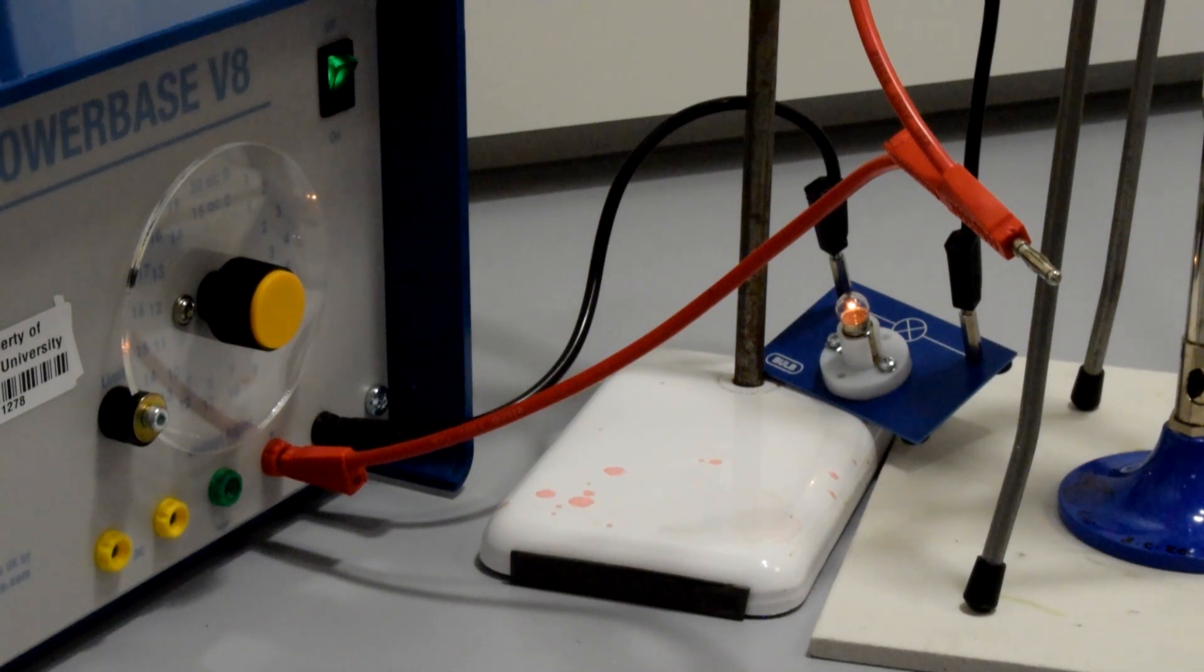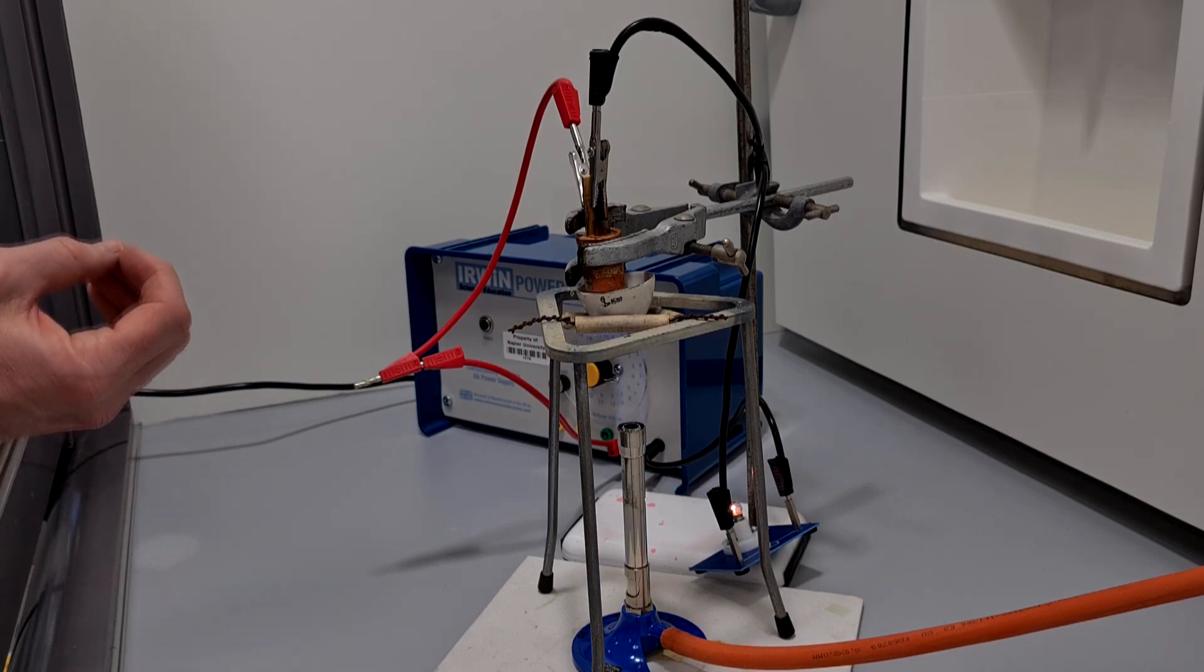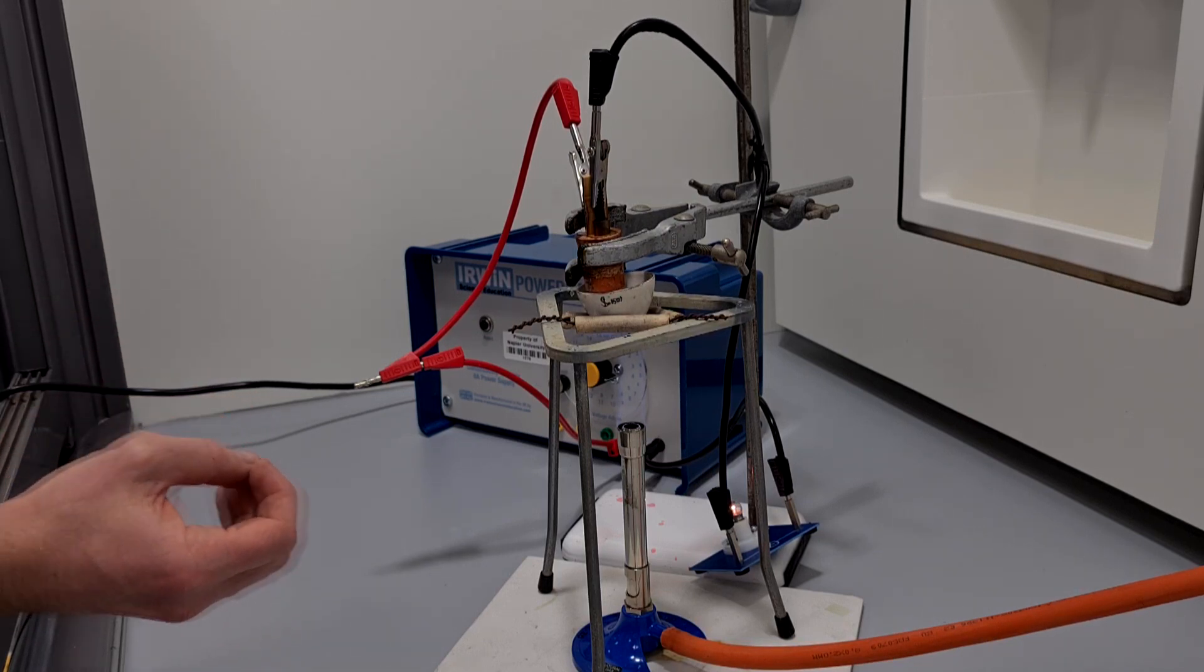And you can see now that the light bulb has lit up as that zinc chloride has turned from a solid into a liquid, showing me that the ionic melt does conduct electricity.